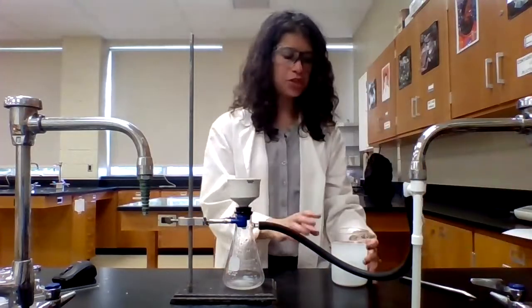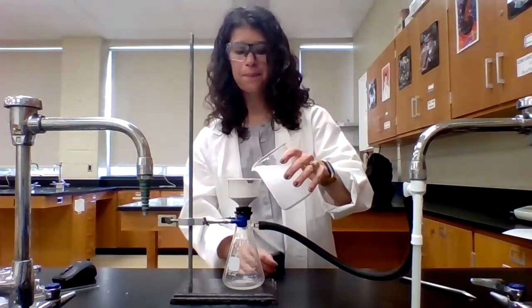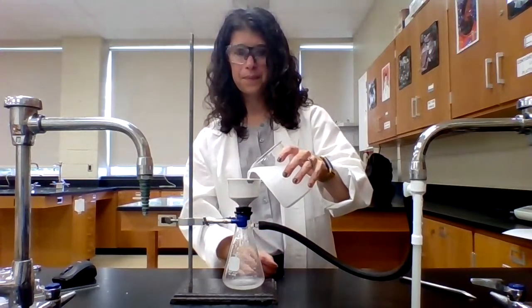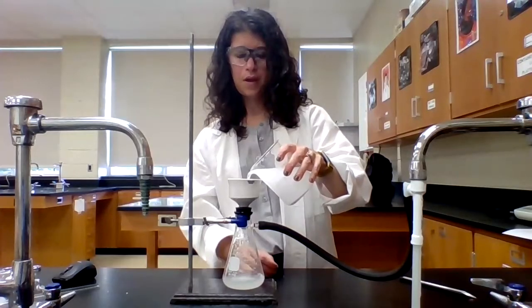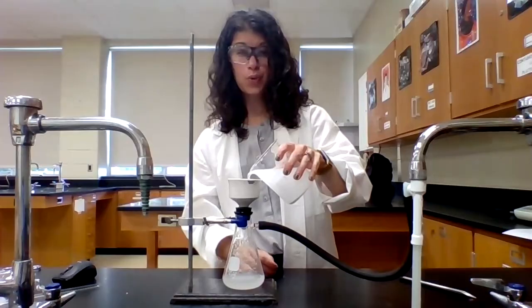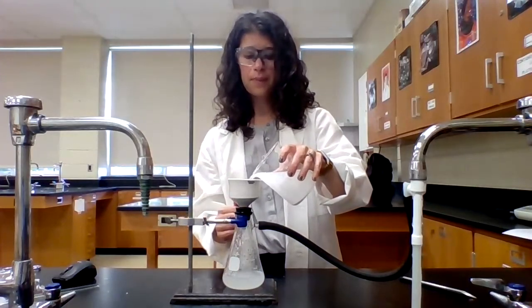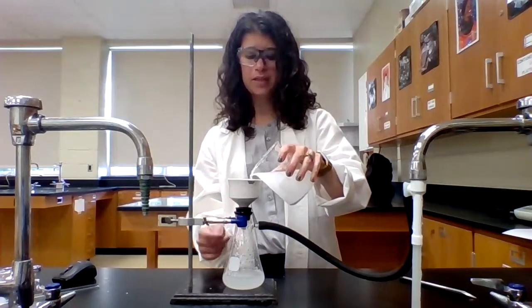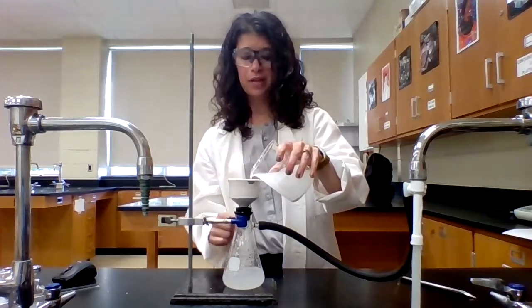So now what I'm going to do is pour my reaction solution into the funnel. Now, I don't want to pour too quickly because I don't want to overfill the Buchner funnel. I also want to be careful because this sidearm flask only holds 250 milliliters, and I have 400 milliliters of solution.